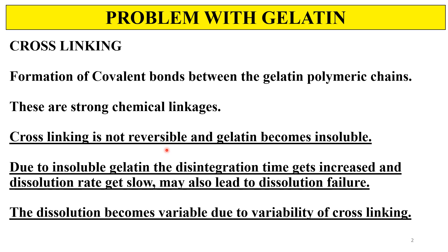The formulation may be a soft gelatin capsule or hard gelatin capsule. Due to this increased disintegration time, the dissolution rate gets slower, which may also lead to dissolution failure. This crosslinking is always a variable process — it is not uniform. Thus, the dissolution becomes variable due to the variability of the crosslinking.